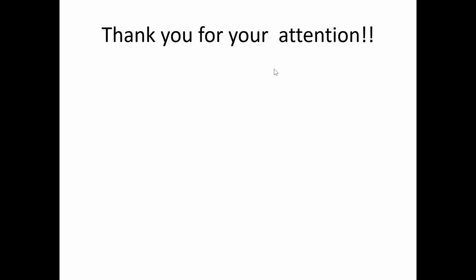So there's a comment. I think your DIA methods definitely have a lot of promise, but you yourself brought up the point that a lot of false discovery rates are there. So is there still a way out that we can say which method can be much more robust eventually? Whether the technique can be made more robust?